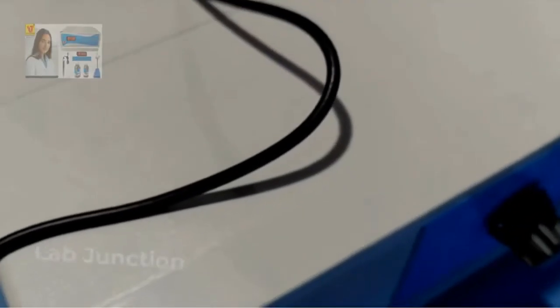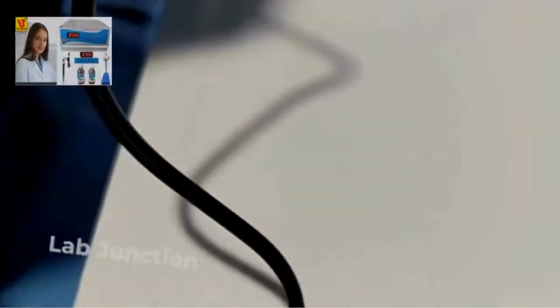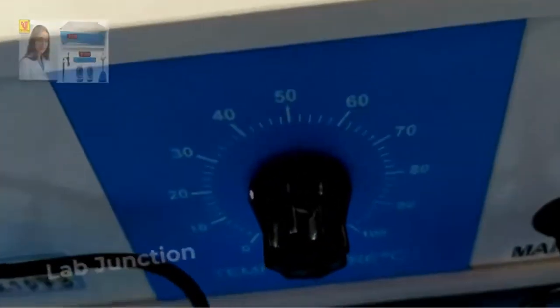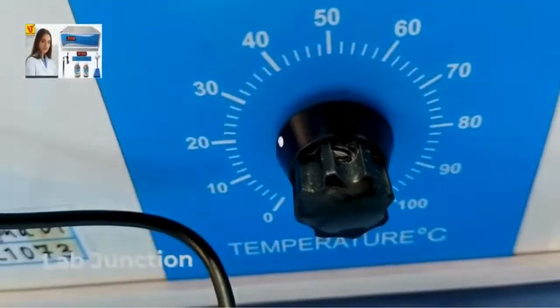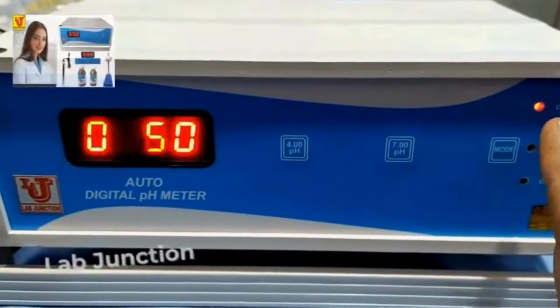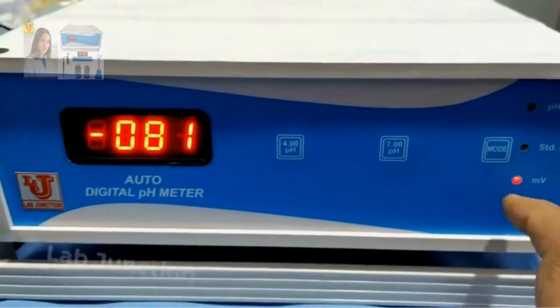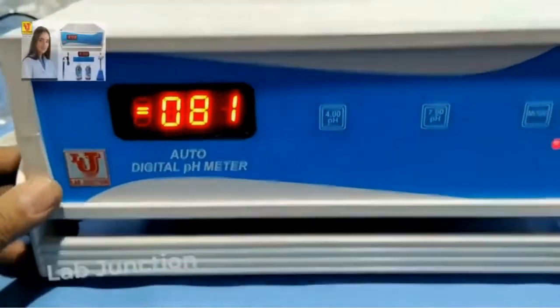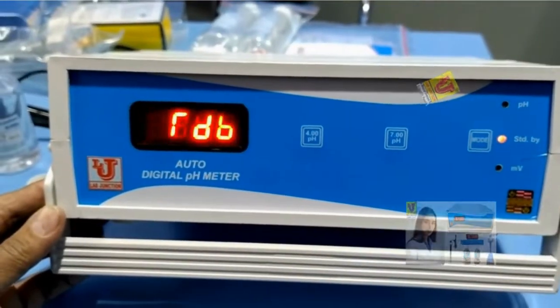First of all, you have to set the temperature. The default is 25 degrees, set from the back side of the instrument. These are the keys: this is the mode key. If you press it, it goes to pH mode. Press again, it goes to millivolt — ORP, oxidation reduction potential. Press again and it goes to standby.